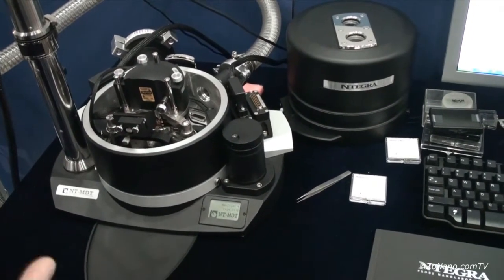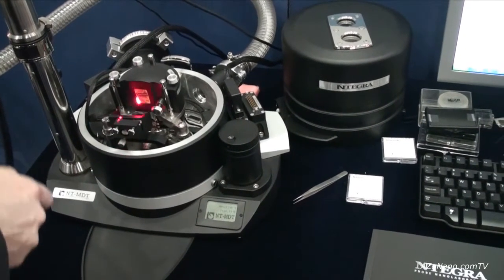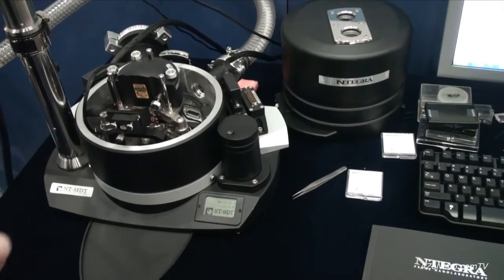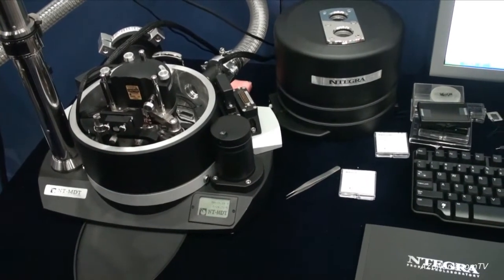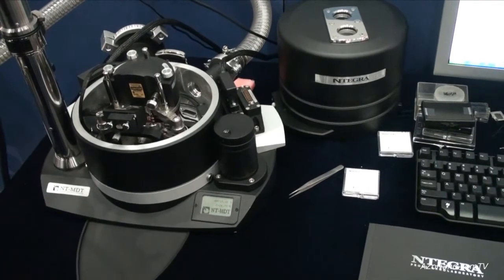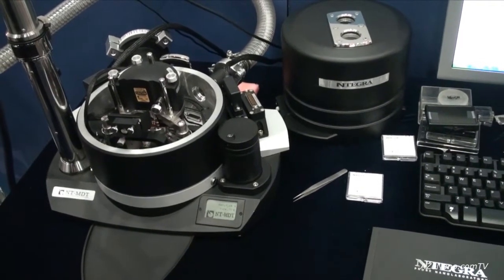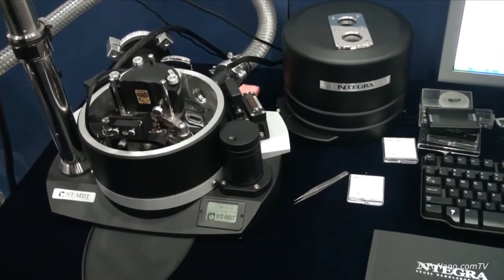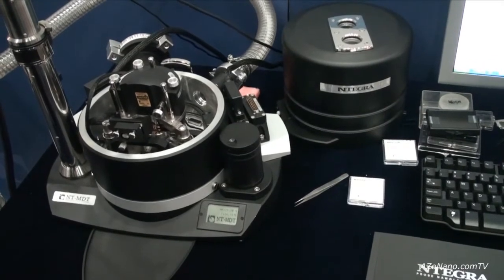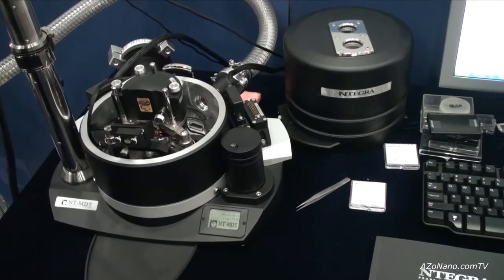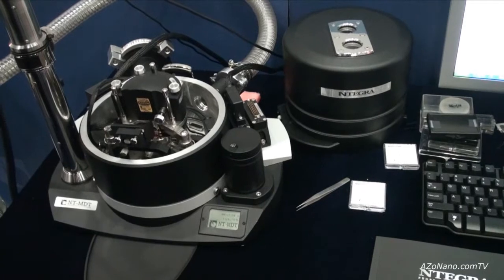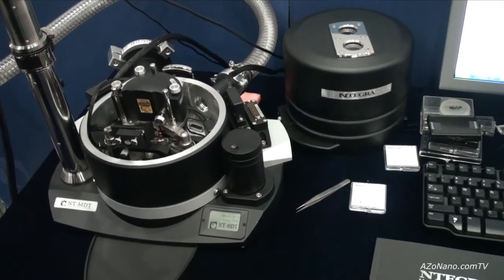All these six axes of this canyon—three we get from the head XYZ and three we get from the bottom—together six axes allows you to get quite a big scan range up to 200 micron which is fully closed loop. The closed loop has very low noise sensors which allows to get in closed loop mode atomic resolution even.